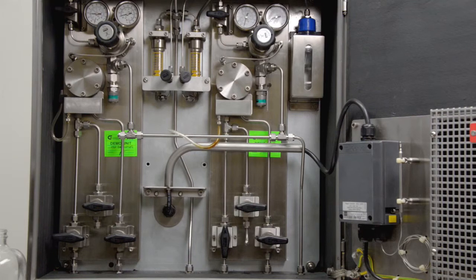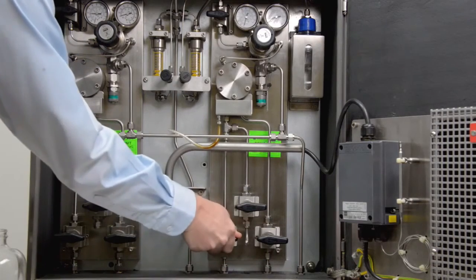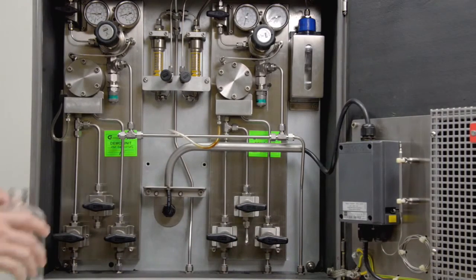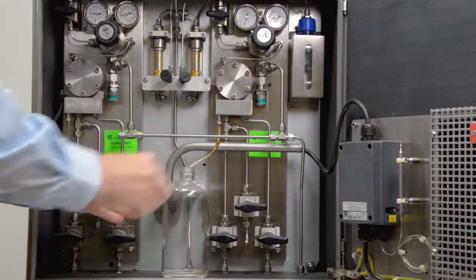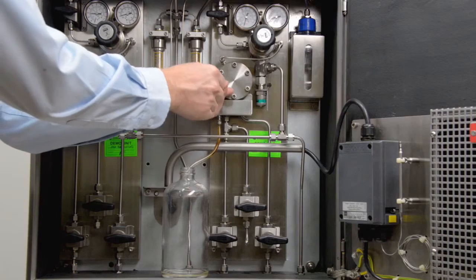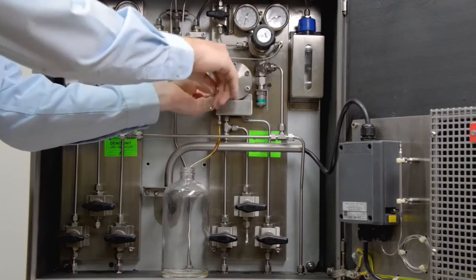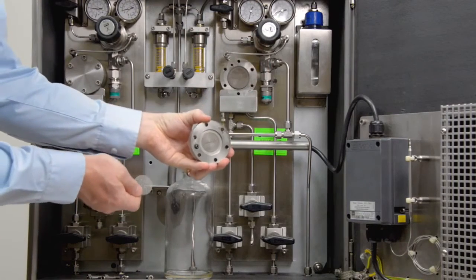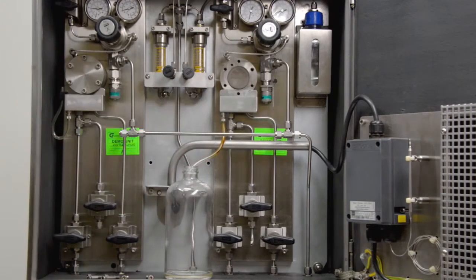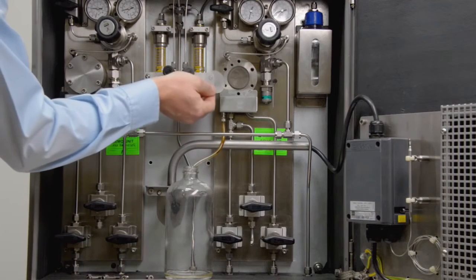If the filter is clogged in the fast sample loop, you can easily change it. Close the valves on the fast sample loop. Put the tubing below the fast sample loop into a waste bottle to collect the waste. Open the filter housing by loosening the 6 Allen screws. Remove the filter housing cover. Check clogging of the filter and damage of the O-ring.